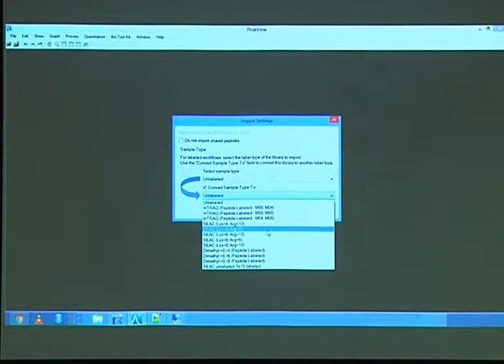You should know that some of them, like mTRAQ and dimethyl, modify the peptides. So if you have a library from SWATHAtlas and you want to use it like that, it might be that it doesn't work that well. The reason for this is that these tags usually affect the retention time and may affect the fragmentation pattern. I haven't tried it, but you can.